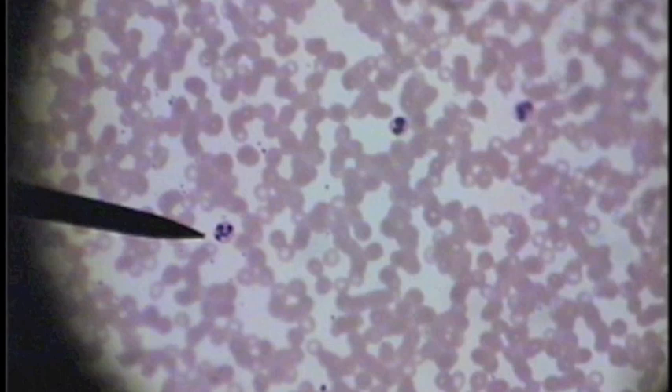In this field of view, we see primarily red blood cells. You can tell the red blood cells because they are the most plentiful. They are biconcave in shape, and you can actually see little circles — they look like hollow circles. Those hollow circles that kind of fill up the field are red blood cells, or erythrocytes.